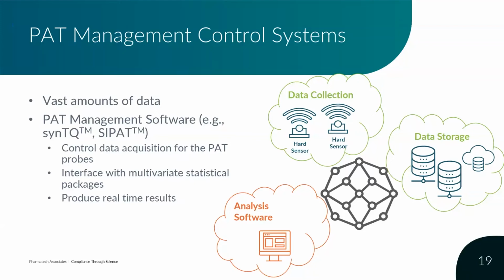Another issue that will crop up is the process analytical technology data management. These tools produce vast amounts of data, and all that data has to be captured, processed, interpreted, and stored, especially if you're going to use PAT data for release of product. You need to have that stored so that if regulatory agencies do an inspection, they can have access to that data to confirm that, yes, this product did meet specification. So there's a lot of technical skills that are needed here.